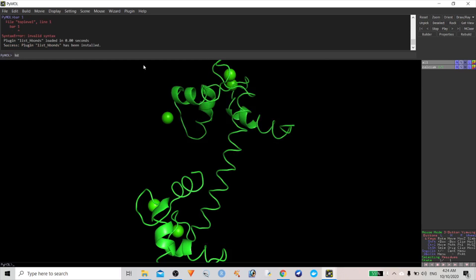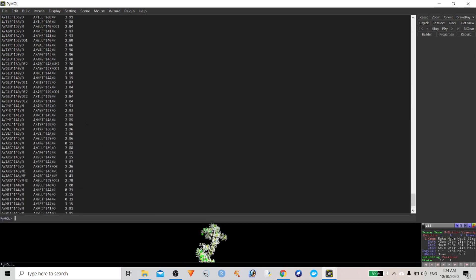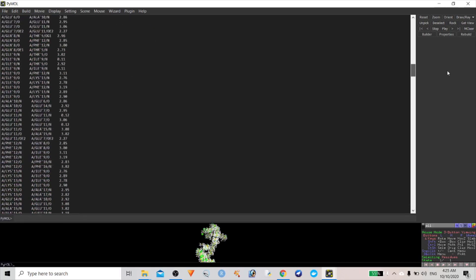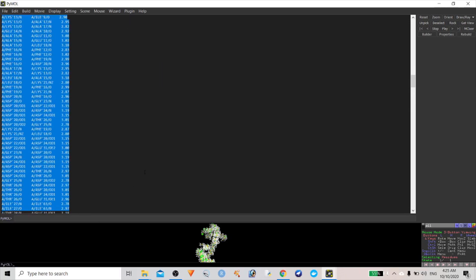To find the total hydrogen bonds for a protein, type 'list_hbonds' then the selection molecule name and hit Enter. It will display a table showing totally how many hydrogen bonds have been formed. You can copy this information or use it wherever you want.